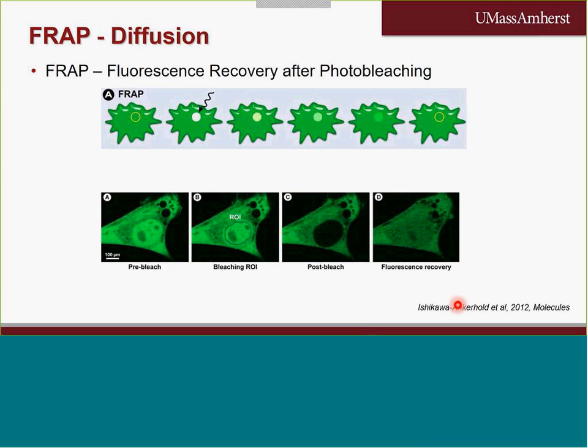You have a particular sample which is stained with a dye. Exposed to a high intensity light, only a region of that particular sample is affected, the one that has received the direct incidence of that high intensity light, and becomes decolored, or actually the emission is basically neutralized because of the radiation of the light in that region.